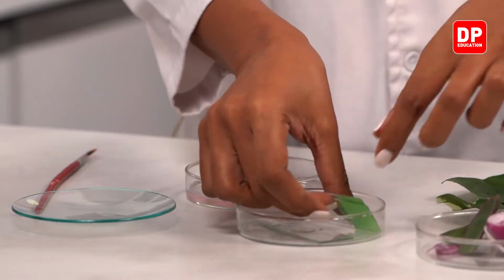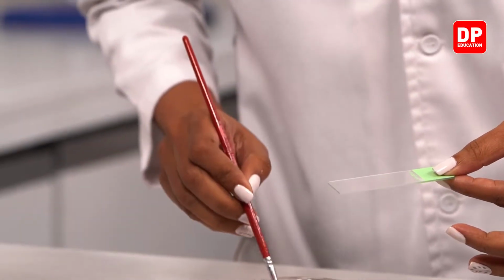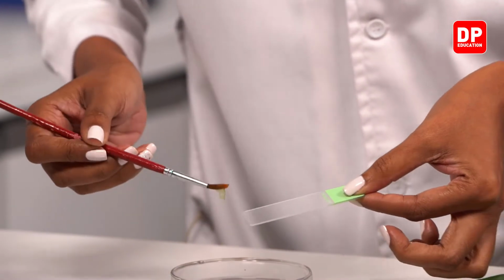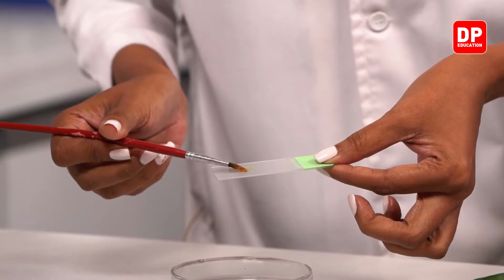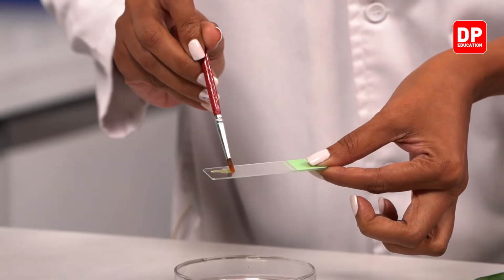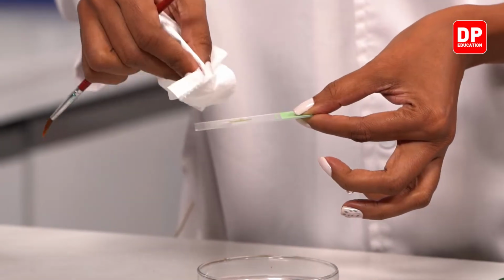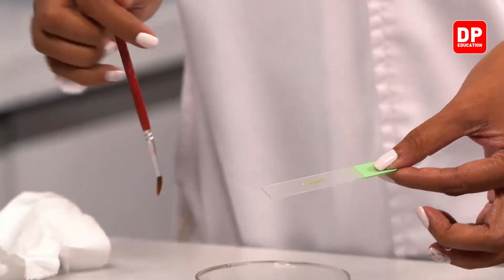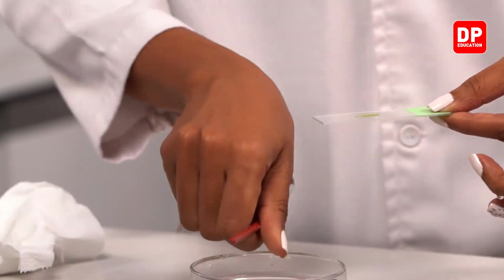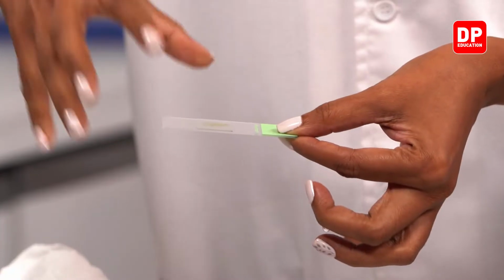Now I'm going to take another slide and mount this. Right. And then put a drop of water. And with the cover slip, you have to cover it like this.